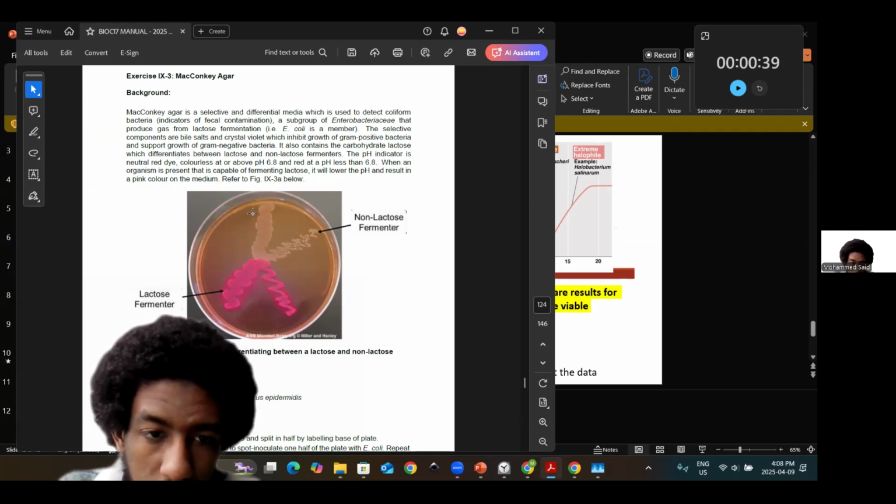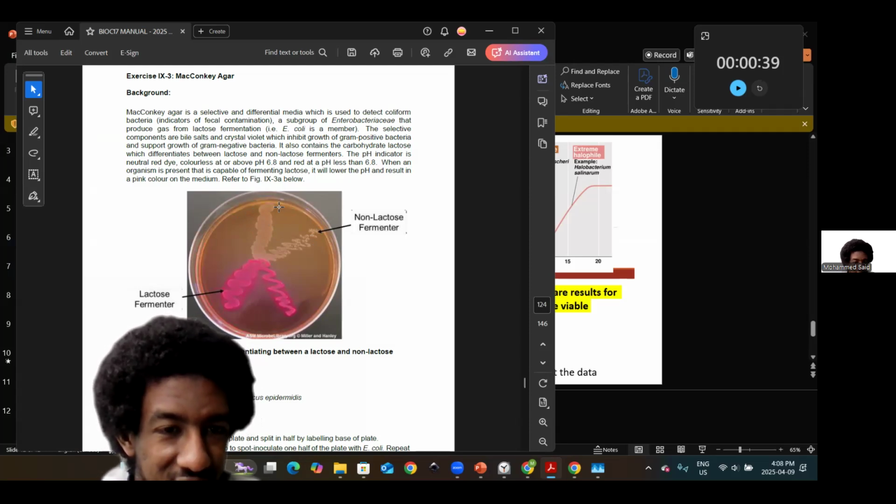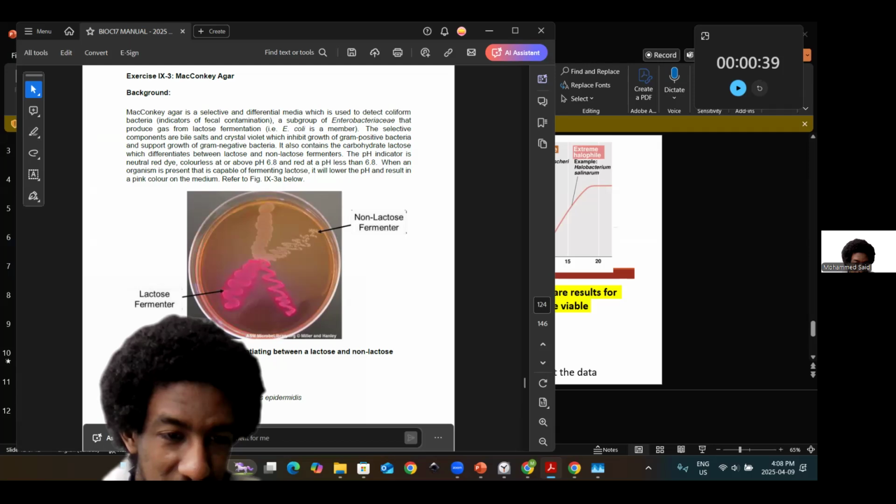So it would be like Staphylococcus epidermidis, less of a hue in range. If you have seen though a reddish hue for, be it E. coli or stuff, well, actually, let me clarify. Would you see Staphylococcus epidermidis? Yes or no? The answer is no, right?